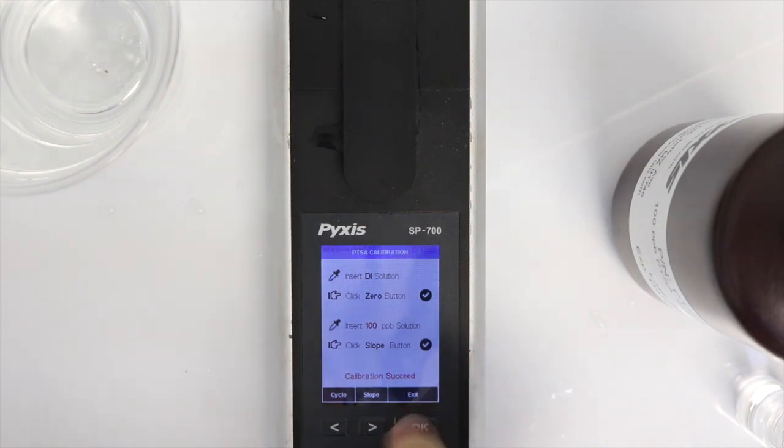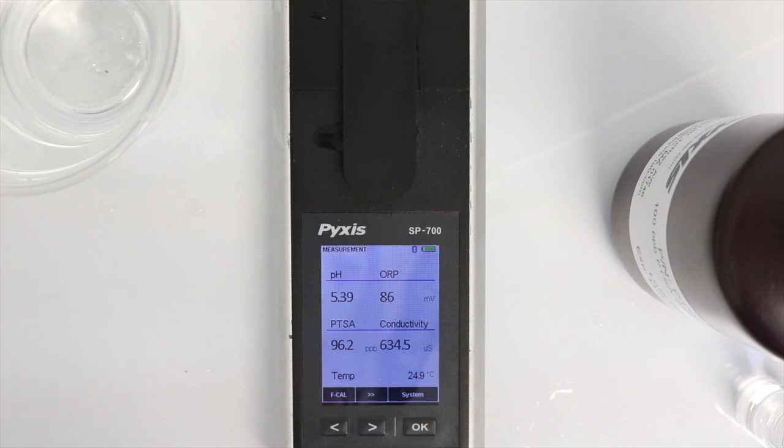Press the OK key to exit to the main display menu. The Pyxis SP700 should read within 1 ppb of 100 and is now calibrated.